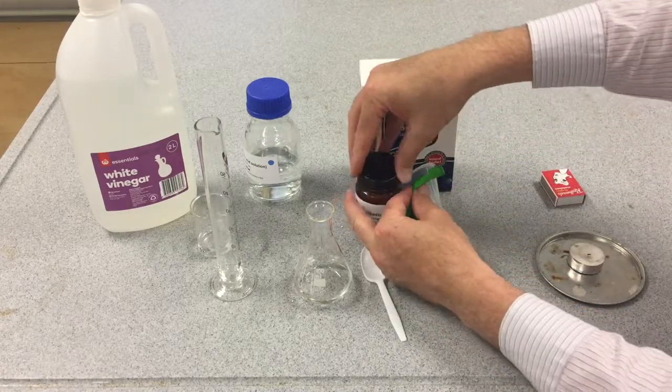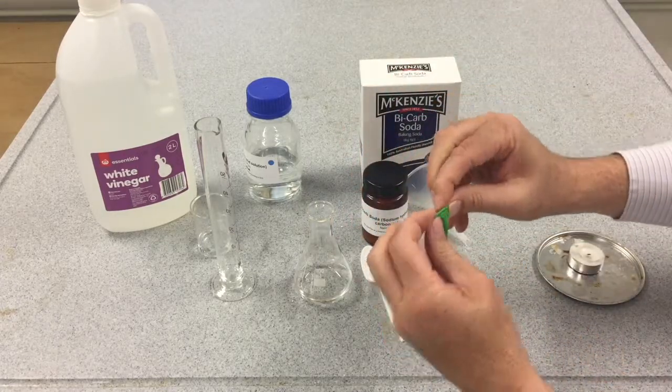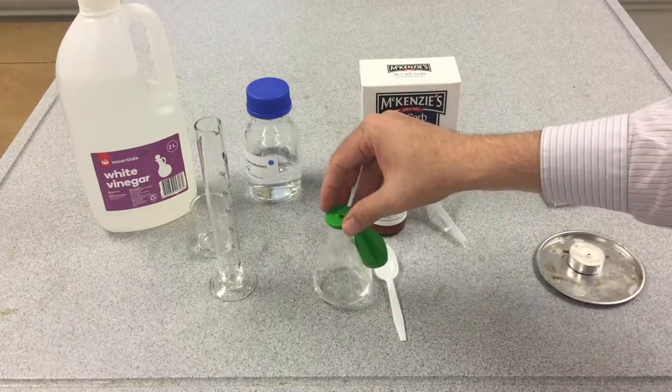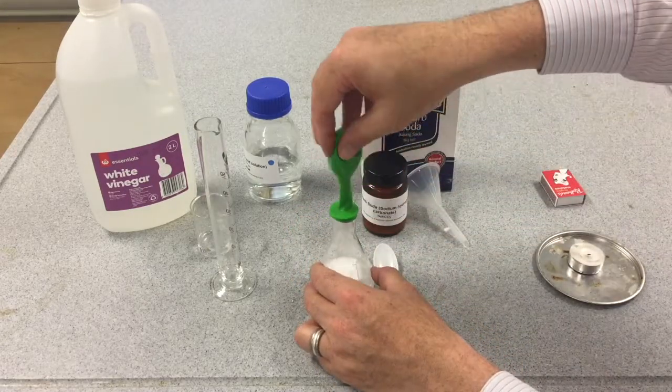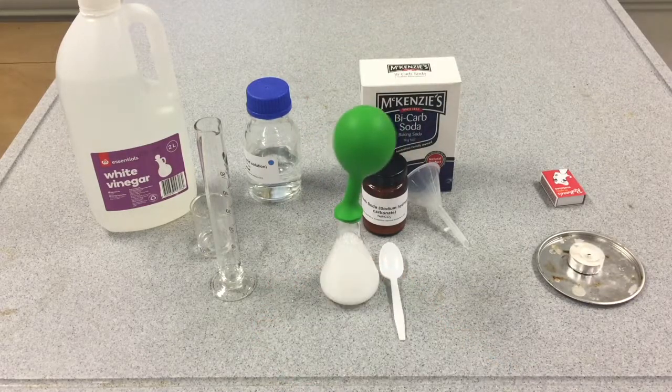Once you have the bicarb in the balloon, you then need to attach the balloon to the top of the small conical flask, but make sure you don't tip the balloon up until it's attached. Once you've attached it, tip the balloon up so the bicarb spills into the vinegar, starting the reaction, and observe what happens to the balloon.